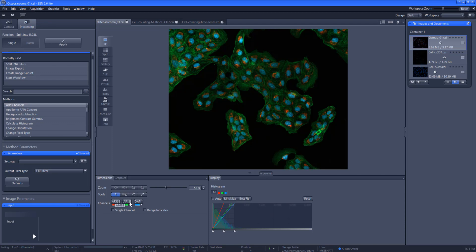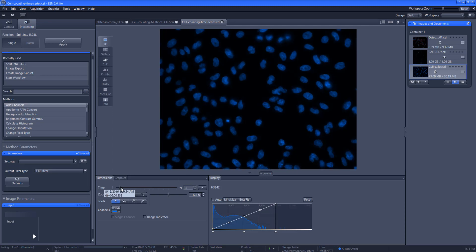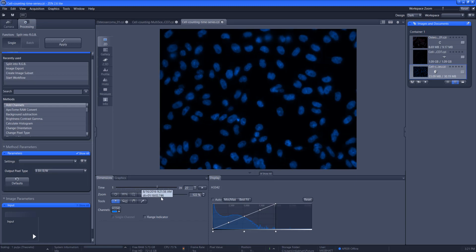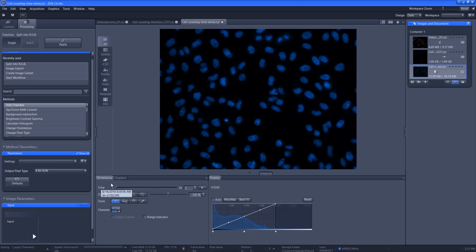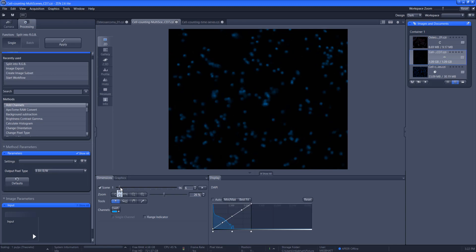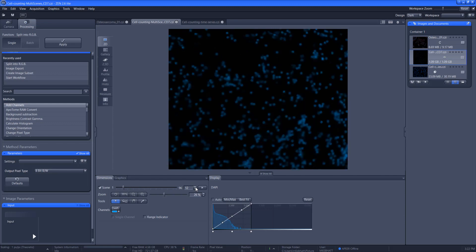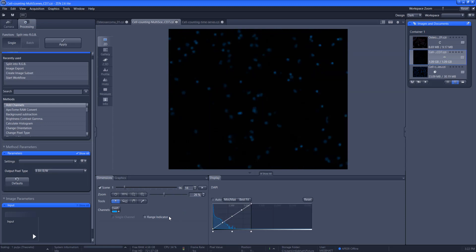Images can also be time series. Here is a single-channel image showing nuclei, and as time goes by you can see cells moving. That's a time series image. Finally, here is a multi-scene image — I have 96 scenes, so well number one, well number two, well number three, and so on. In some cases the images are not perfectly in focus, but it gives you an idea of how multi-scene data is organized.